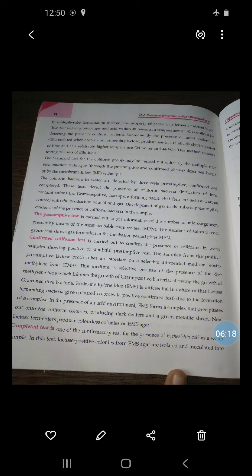Then the confirmed coliform test. This test is carried out to confirm the presence of coliform in a water sample showing a positive or doubtful presumptive test. The samples from the positive presumptive lactose broth tubes are streaked on a selective differential medium, eosin methylene blue.